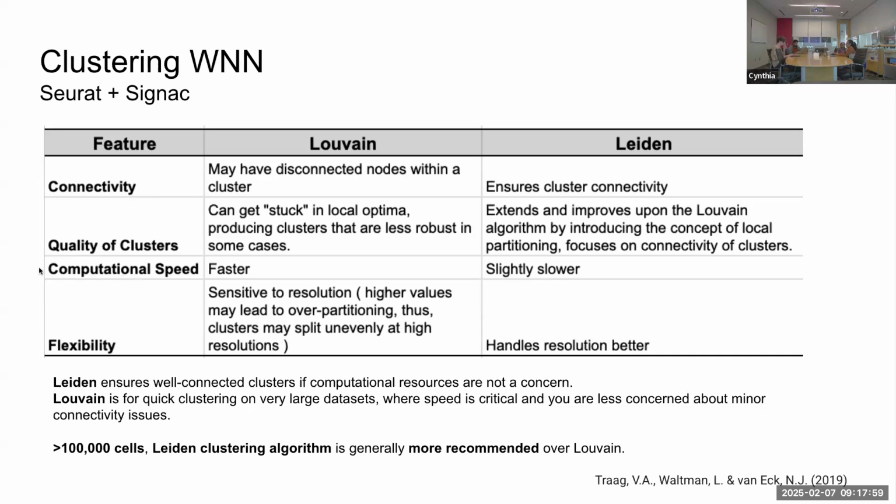We have also a very relevant feature that is the computer resources that we need. We have a cluster available or not, and the flexibility that the algorithm or the method has to produce different configurations. Here I'm only comparing 2 algorithms: the Louvain original and the Leiden, that, in my opinion, is like a second generation of algorithms that arises because when the number of databases or data sets that we have to analyze grows, it was necessary to have available a different approach that could handle this big amount of data.